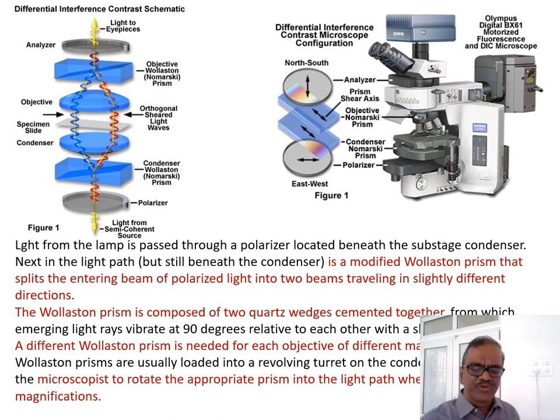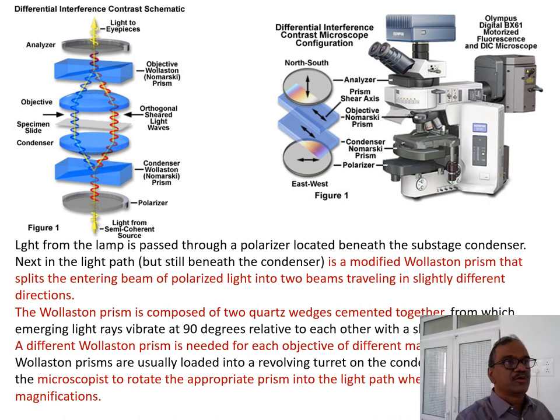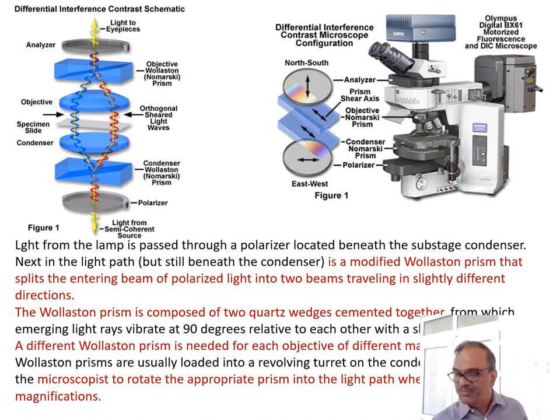So this is not much used in cell biology, even though it is there for various other types. So here the fluorescence microscope, everything is used, and here they have two different spectrums. Okay, modified Wollaston prism. Generally the prism principle is used, what we see as a small one, but here the two beams are traveling in two different directions. Are you able to see that? Like a DNA helix, two beams are going in two different directions, and then they converge in the light to the eyepiece, then you can see the specimen. So okay, this is one of the microscopes available, that is enough.